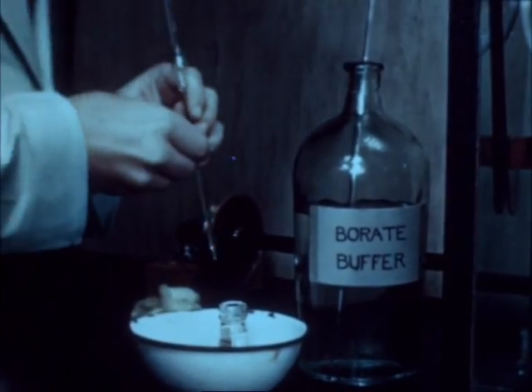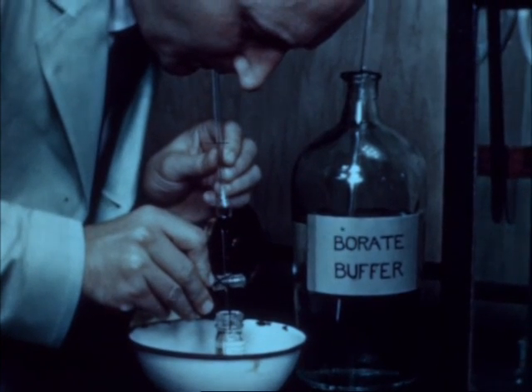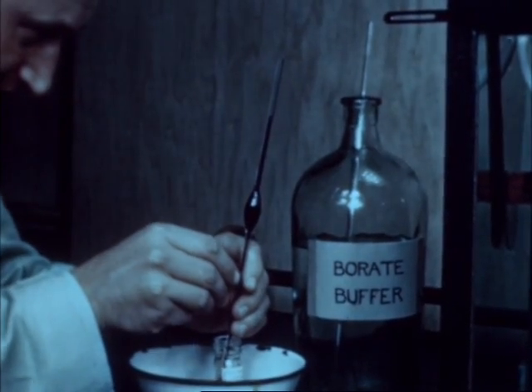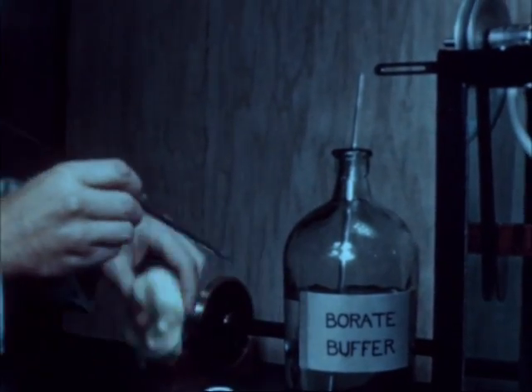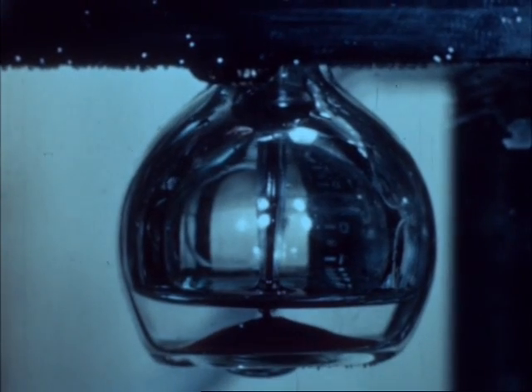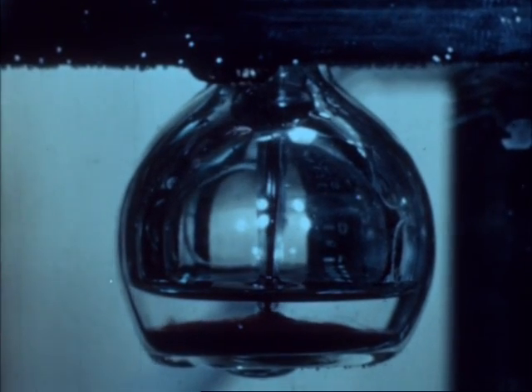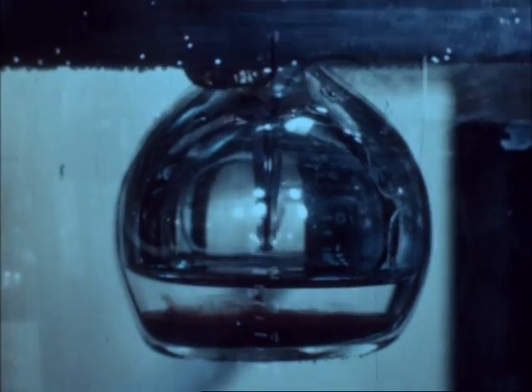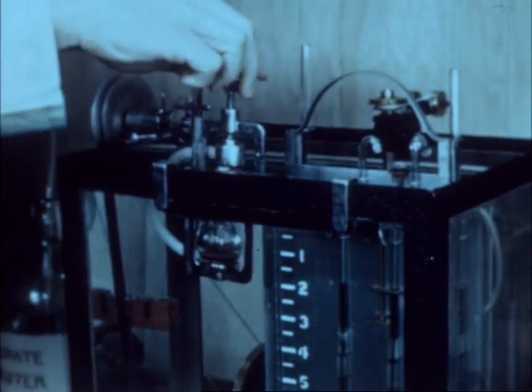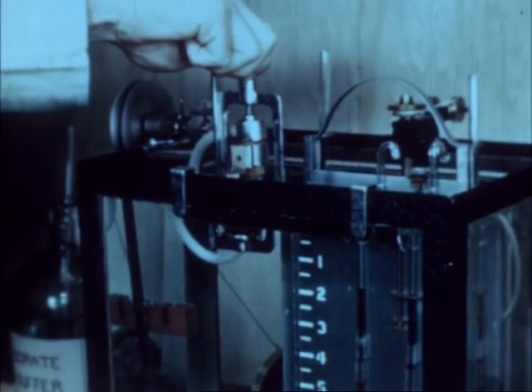Three cubic centimeters of blood are sucked into a stoppered Ostwald pipette, and the pipette is wiped clean at the tip. The measured sample is gently introduced into the bottle, where it lies in a layer under the covering alkaline solution. A special bottle holder with an airtight screw cap is fitted, and the whole device, which is attached to a pivoted lever, is put into position in the water bath, where it is left to come to temperature equilibrium for a few minutes.